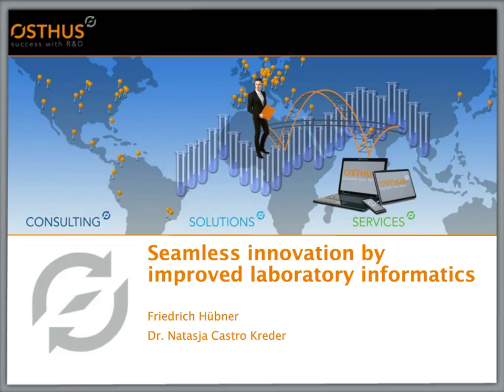Improved laboratory informatics. What does this mean? In our terms, it's about making data electronic, avoiding duplicate data entry, supporting the digital birth of data, and removing manual operations from the scientist's work, and thereby making data referenceable and searchable. All of this is, of course, meant to improve the overall workflow efficiency.